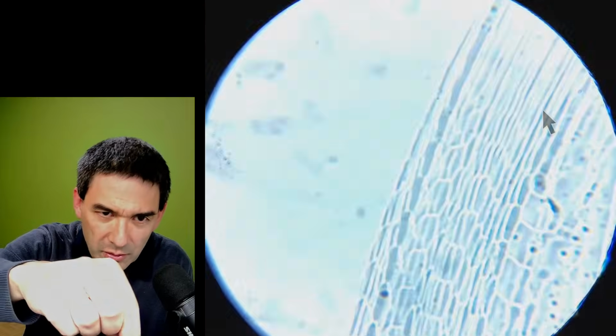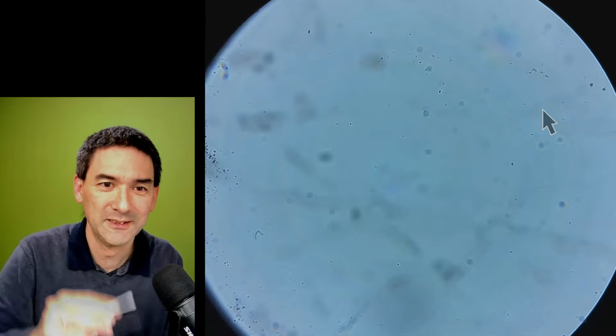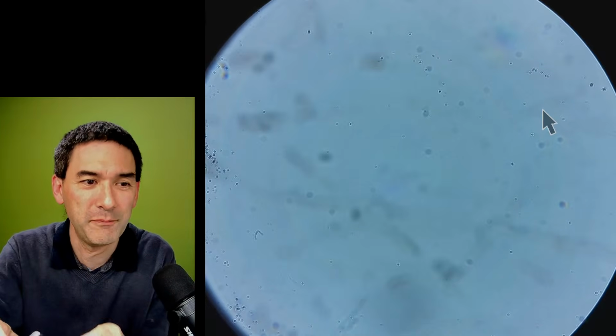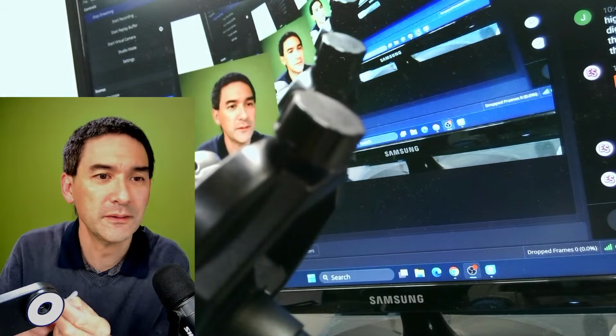I could have tried this earlier. Here we go. Gone it is. Okay. So that's what I used. I've basically done the following. I'll just show you what I have done.